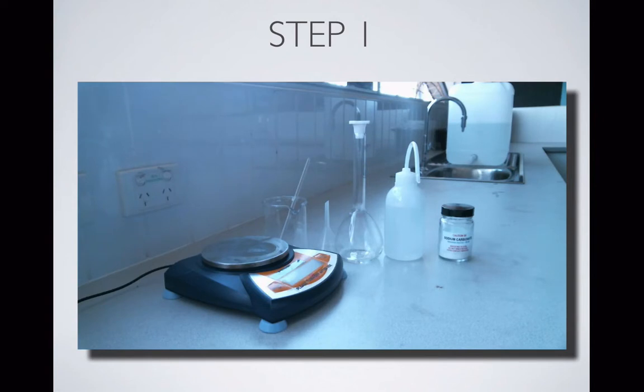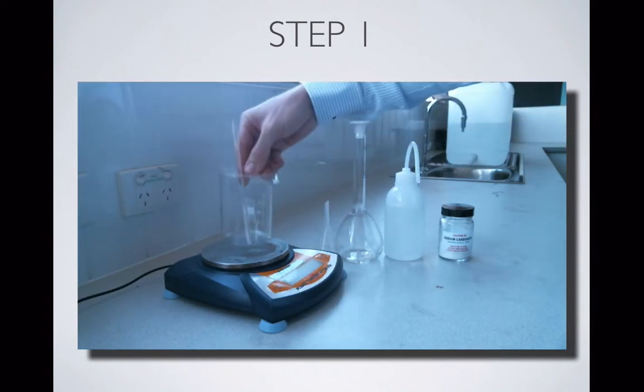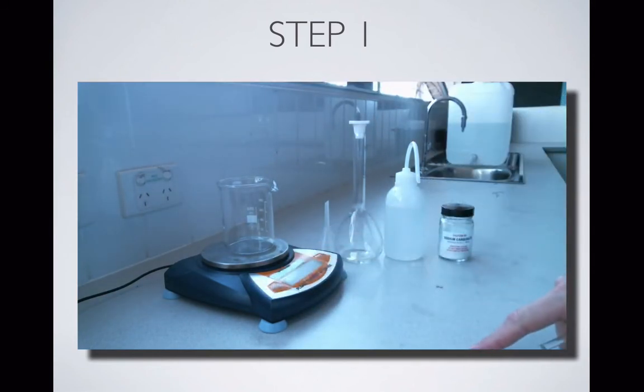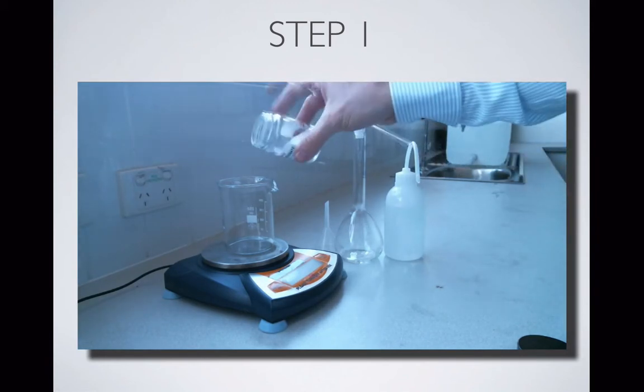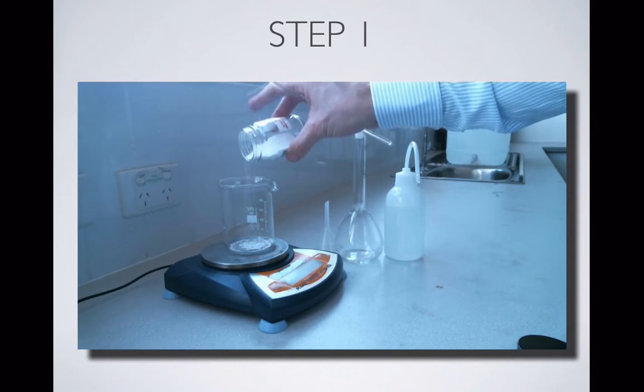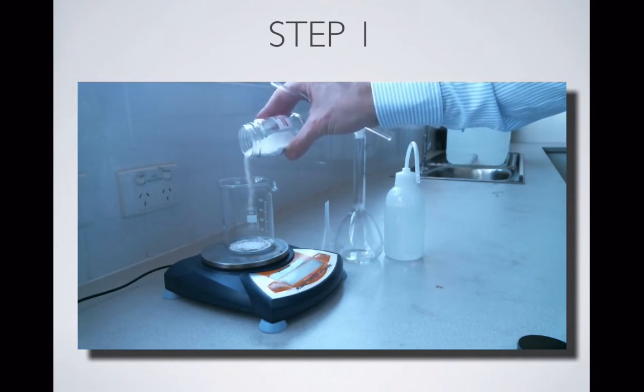Now, weighing this out accurately is not about getting exactly that number of moles. It's not about weighing exactly 2.65 grams of sodium carbonate, which would be 0.025 moles. But it is about knowing accurately how much I've taken. So I'm going to try and get somewhere close to 2.65 grams, but I'm not going to worry if I don't get it exactly right.